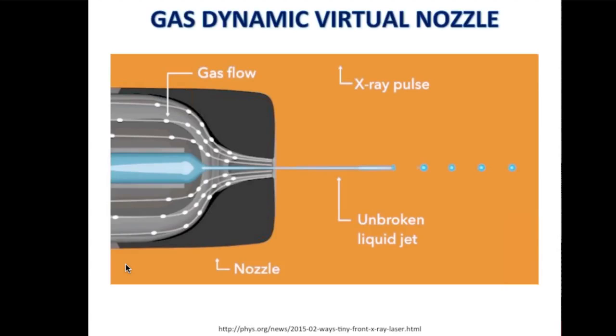If you have a very huge liquid jet diameter, like 50 microns, then you're going to get a majority of the scattering from the solution, and the probability of hitting the sample also goes down. So you want the liquid jet diameter to be comparable to or slightly above the size of the crystals. The way you do that is by using gas to focus the liquid.